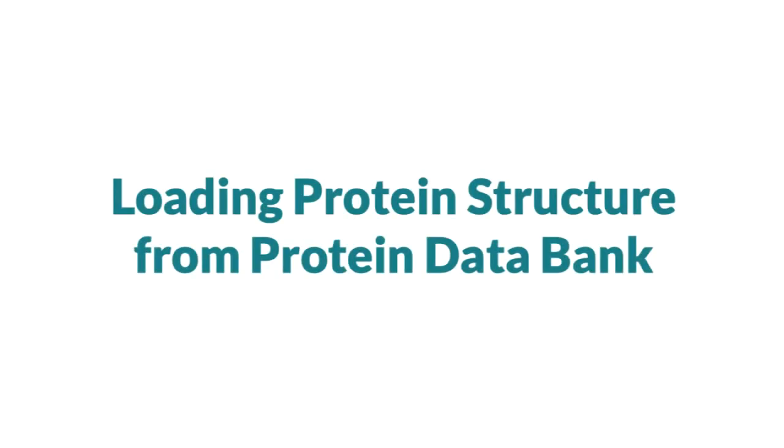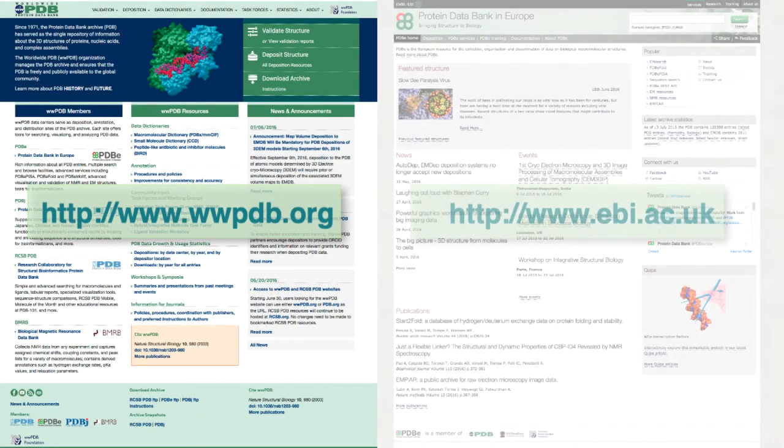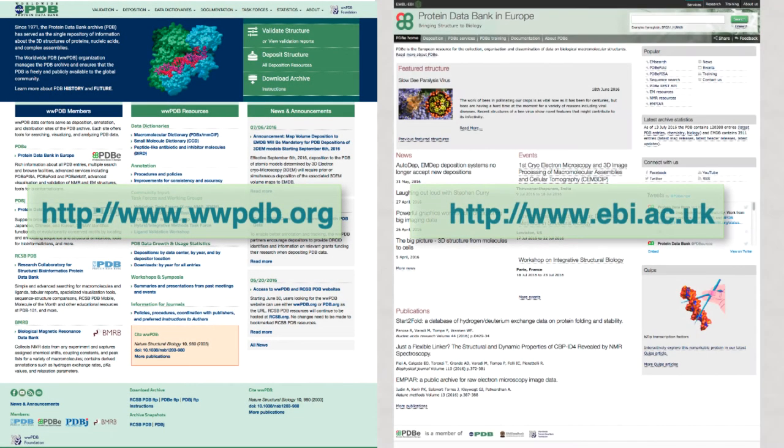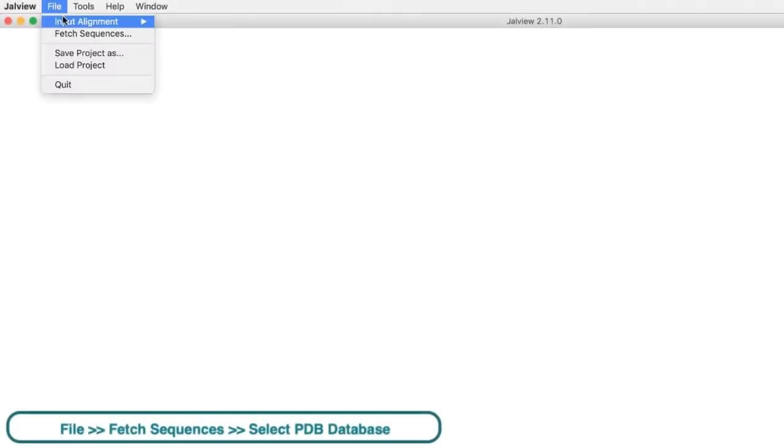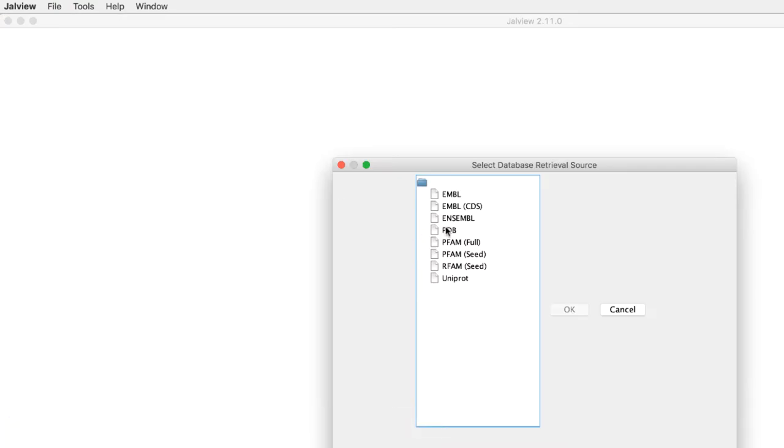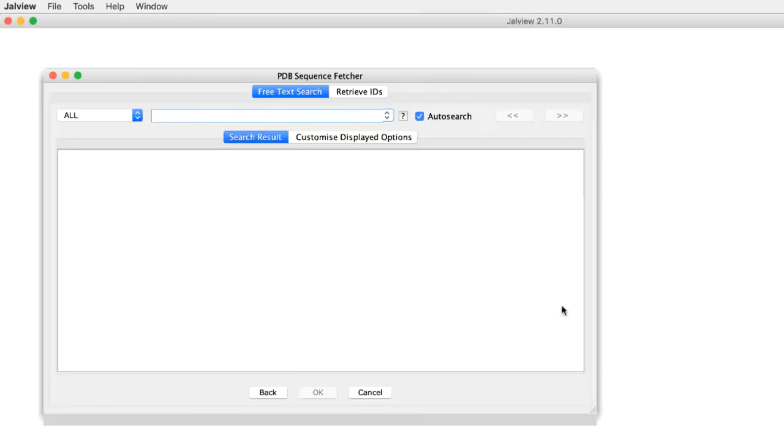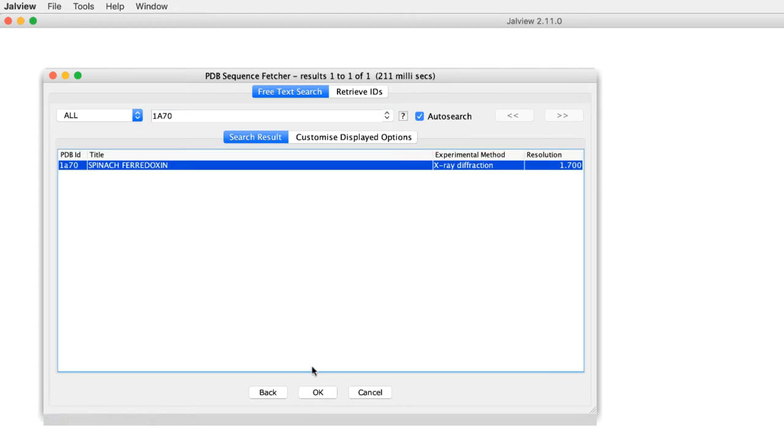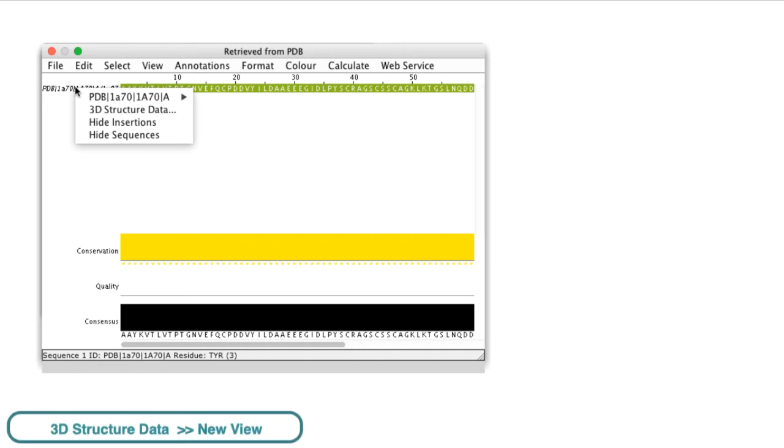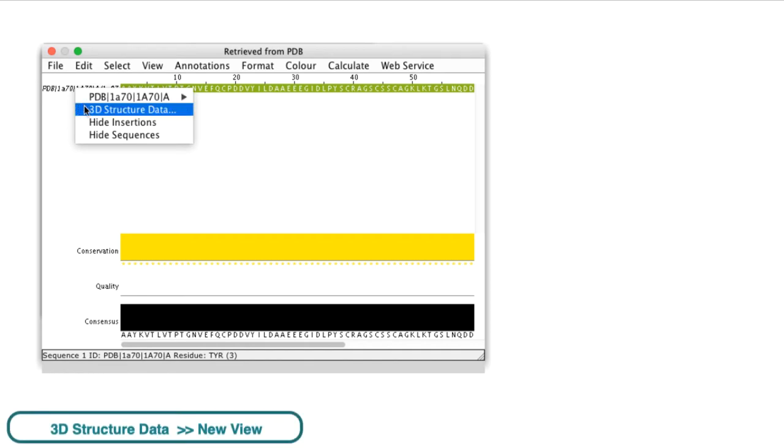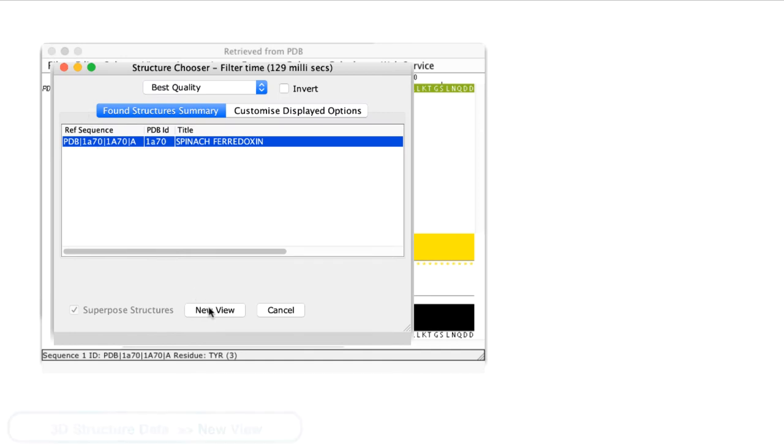Jalview can load protein databank format files directly from the WWPDB by connecting to the PDBe at the EBI. Go to the File menu and select Fetch Sequences, then select the PDB databank. In the sequence dialog box, enter the PDB ID and click OK. In the alignment window, select the sequence, right-click the mouse to open the context menu, select 3D Structure Data and in the structure chooser dialog box, click View.